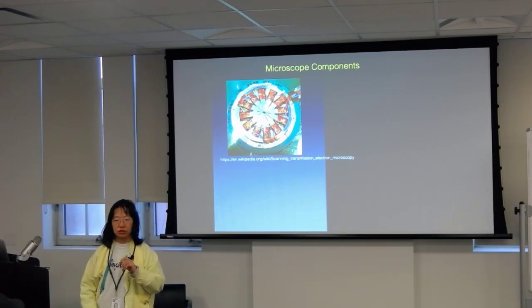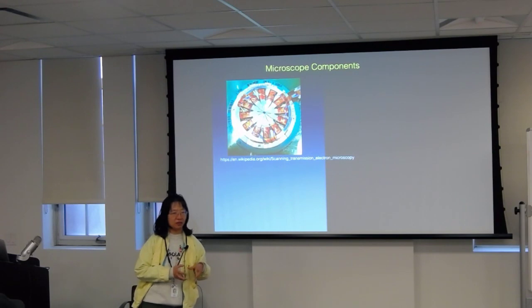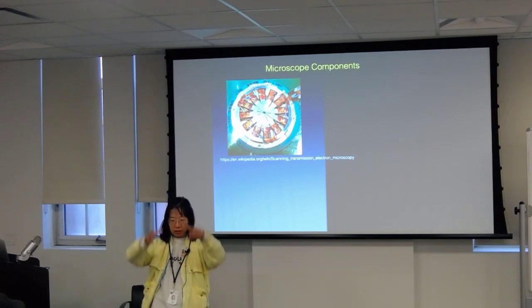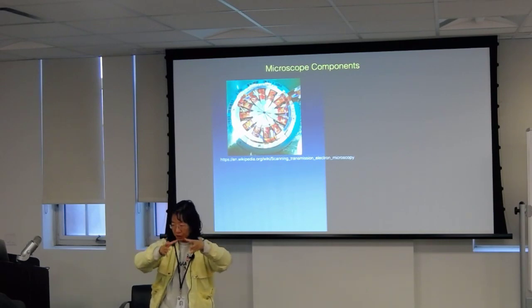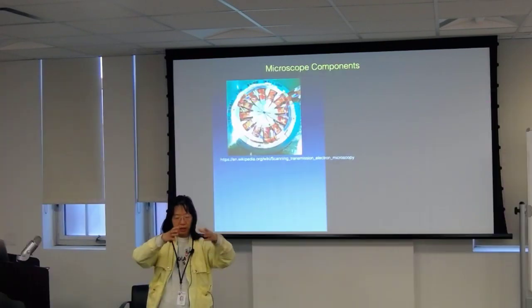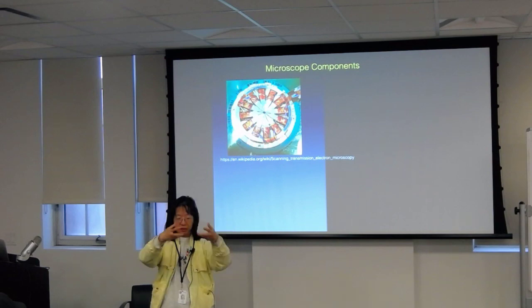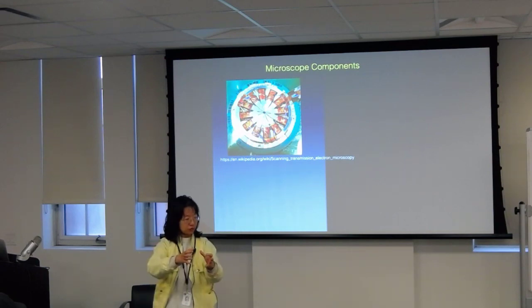Okay, so whenever they say I have some kind of aberration corrector, that would be basically the stigmator part. You can think about it as the stigmator part. I'm taking what I get from my lens, I want to make it more perfect. Because when I get out from the lens, it's not going to be really good, because my lens is not that perfect.